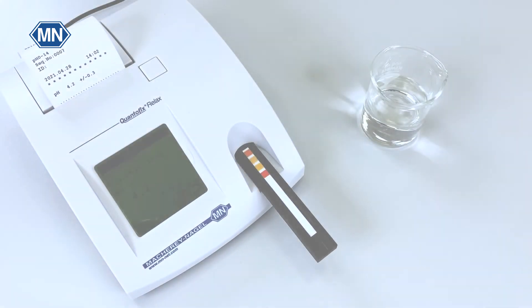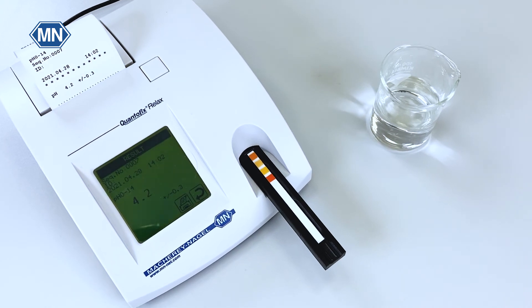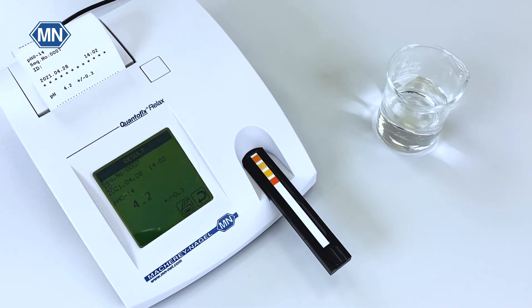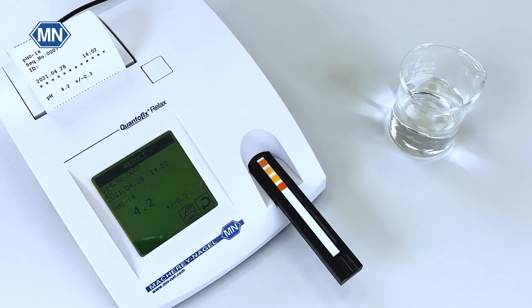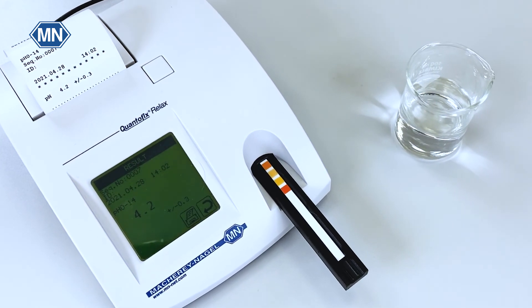Please note that instrumental pH strip reading does only work with pHFix test strips. Indicator papers and pH indicators are not compatible with the reader.